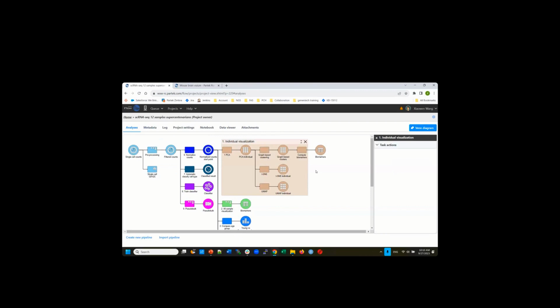Here, I also want to talk about the fact that when you have multiple samples, people always think, okay, do I have a batch effect? This is my thought about batch. When you see batch, usually that means non-biological factors will cause changes in the genes of your data, right? For example, if my data is processed by different labs or by different prep kits, that might cause some batch. Or if I want to integrate my data with data downloaded from GEO, then you might have a batch effect.